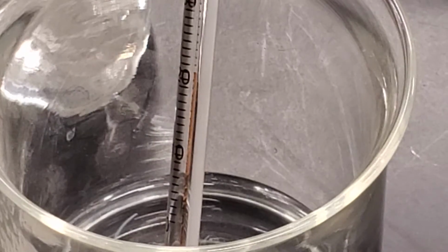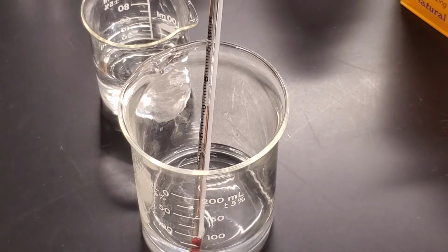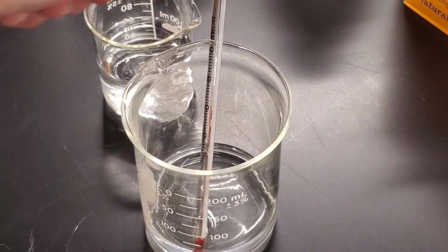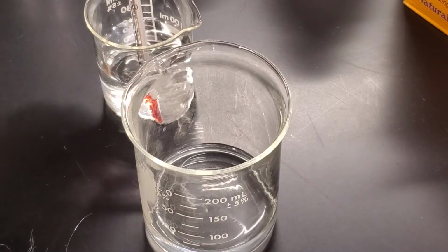All right, so zooming out, step 2 mentions that we need to add the steel wool to the vinegar. So all we've got to do is place this steel wool into the vinegar. I'm going to momentarily move my thermometer out of the way.